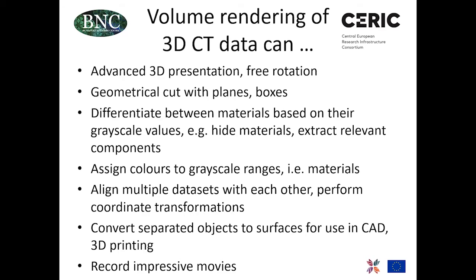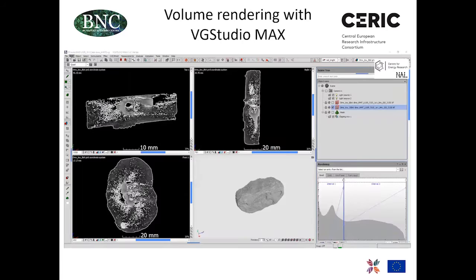So there is deviation from the plan, and you can correct the procedure accordingly. And finally, these programs comprise also very impressive movie creating features. So you can record also motions within your sample.